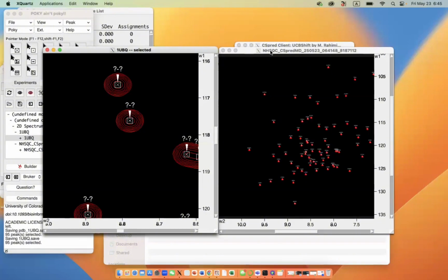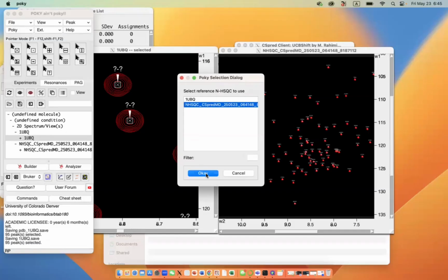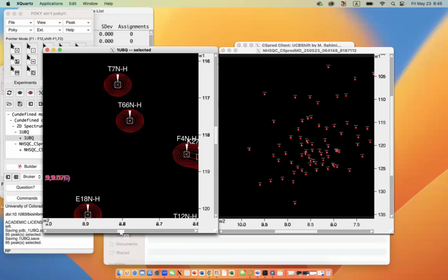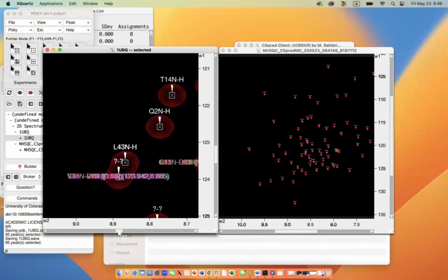And then we can do the peak matching. Just type the two-letter code, capitalized RP. The target spectrum will be the left one, which we already removed the labels from. You will see some peaks are already assigned and others are marked with a question mark, but with candidate assignments. For these unassigned peaks, we can use the Pine assigner to help us assign them.